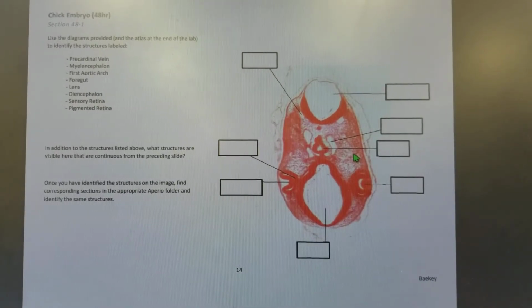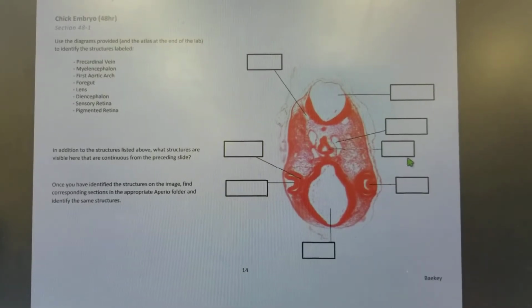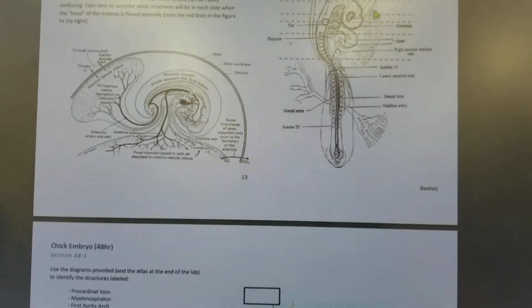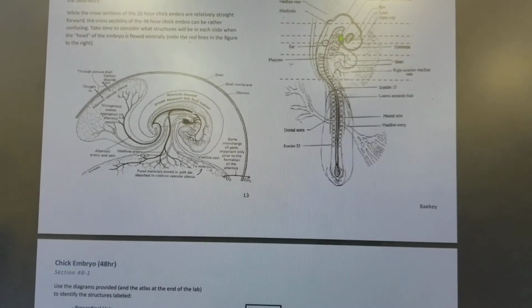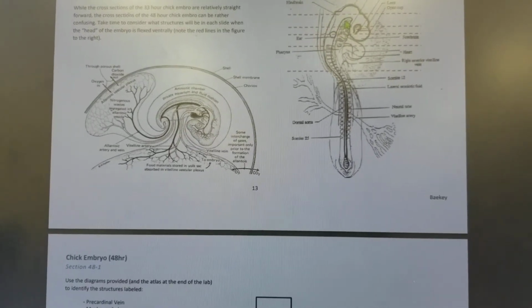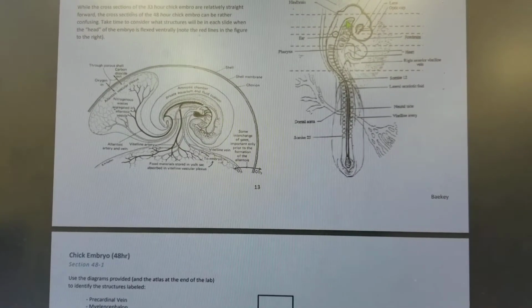The mesencephalon is basically coming out of the screen at us because we've gotten this folded embryo. So we're making a cut here, for example. This line right here will go through the mesencephalon here, the diencephalon here, and then the myelencephalon here, and the mesencephalon and metencephalon are here and here respectively. Okay?